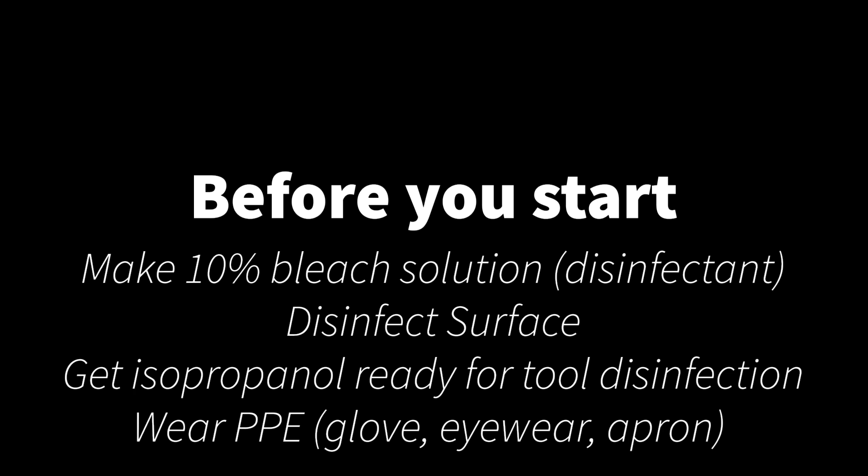Before you start, make sure you make a 10% bleach solution. This is what you use as a disinfectant and you'll use this to disinfect the surface you're working on both before you start as well as after you complete this exercise.